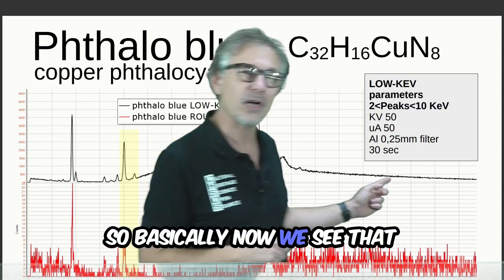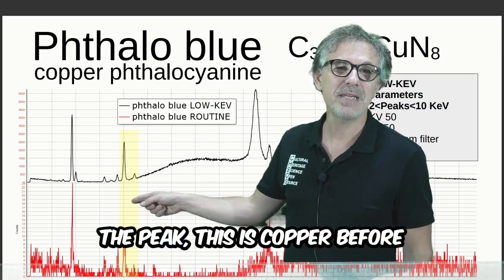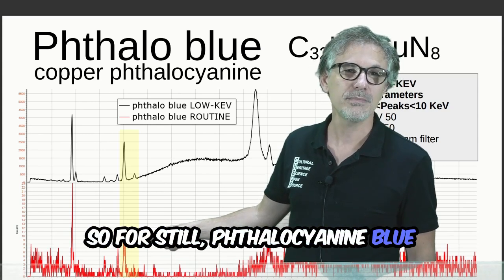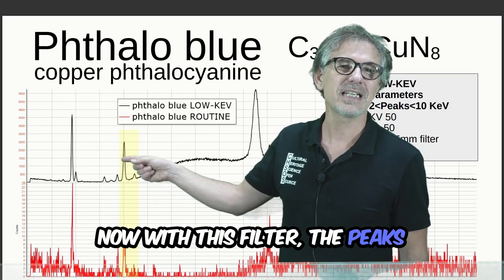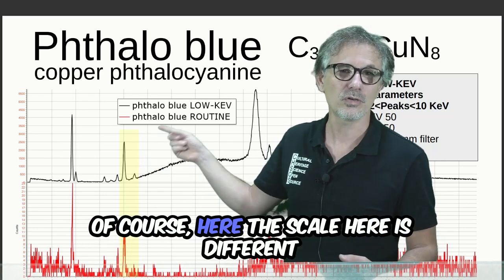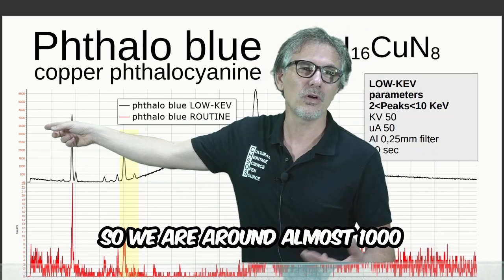Now we see the peak, this is copper before, still for phthalocyanine blue. With this filter the peak of phthalocyanine is much bigger. Of course the scale here is different, we are at almost 1000.